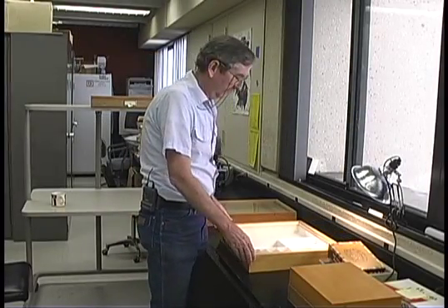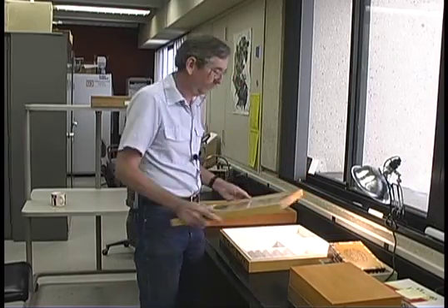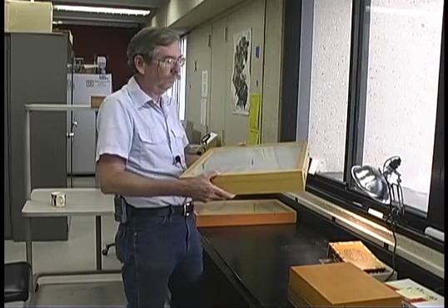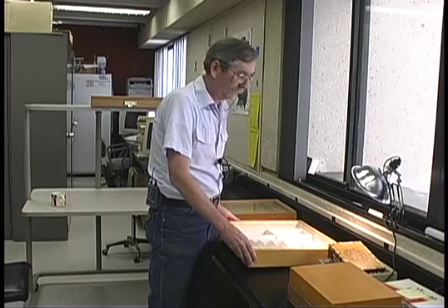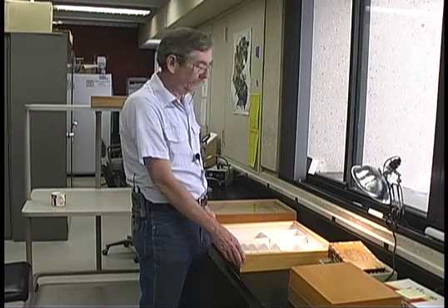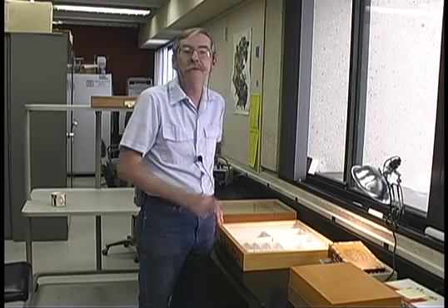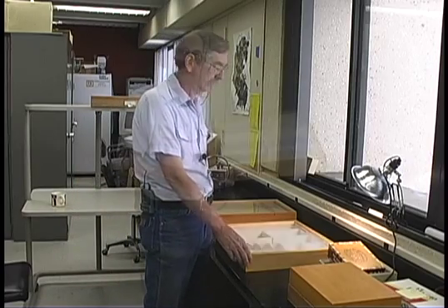One important advantage of Schmidt boxes is that they're small and compartmentalized. They can be placed on a bookshelf much the way books are stored. At the pinnacle of storage devices, we have what we call the museum drawer. Museum drawers are generally wood and they conform to a specific set of dimensions. Actually, there are multiple styles of dimensions, and one needs to consider which particular style they want to buy into when they begin purchasing or building these.